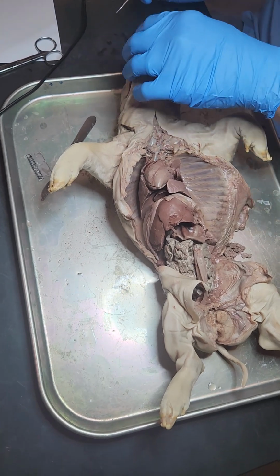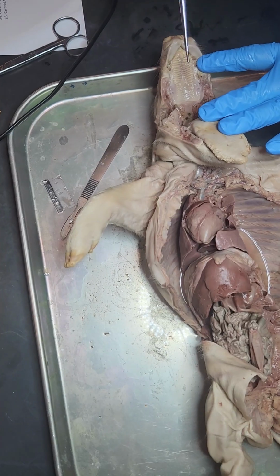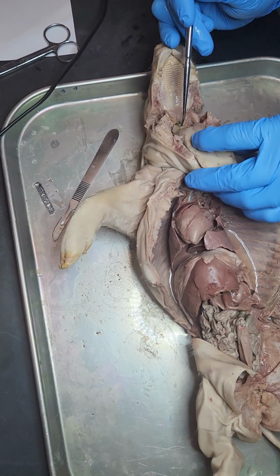Okay, we're good. So first is tongue. Tongue's right here. Okay, hard palate, it's the roof of the mouth that's hardened. Clicks. Soft palate, it's right below it. Okay, it's soft there. In behind it's the nasopharynx.